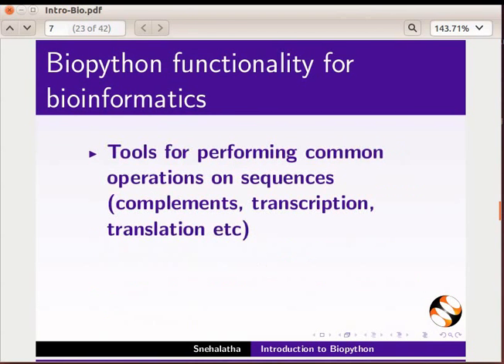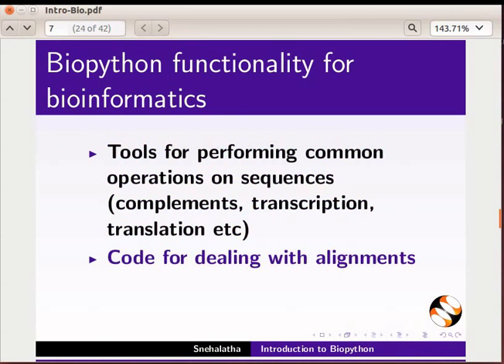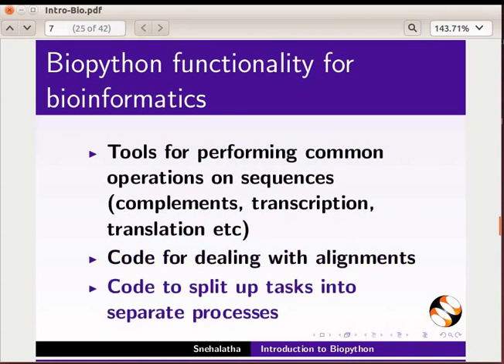Biopython has tools for performing common operations on sequences, for example to obtain complements, transcription, translation, etc. It also provides code for dealing with alignments and code to split up tasks into separate processes.